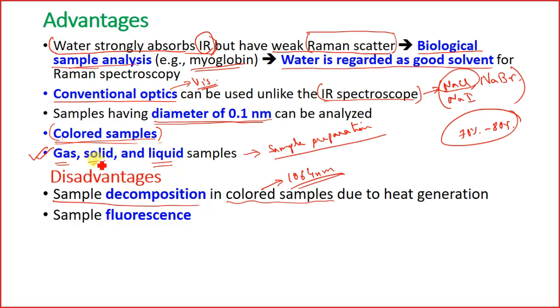However, there is a way around this. Usually, if it is a solid sample, then the solid is converted into pellets. Now, these pellets are put into a holder. Suppose this is the holder. This holder will rotate the sample. Due to the rotation, whenever the radiation falls from the top, it will not fall on a fixed place.